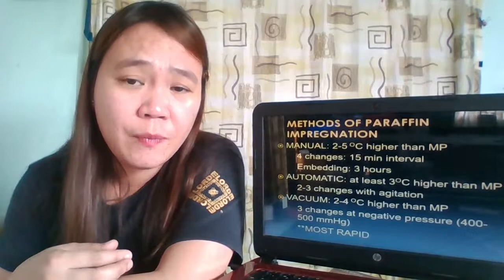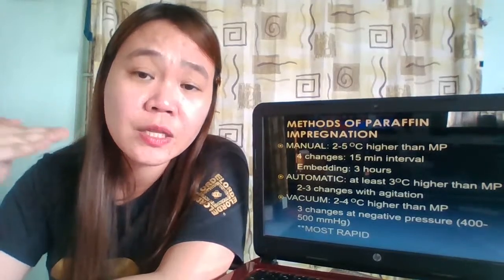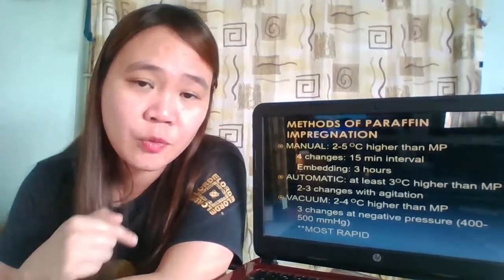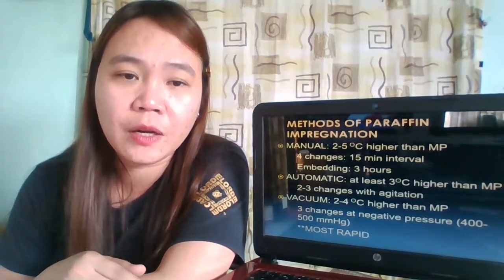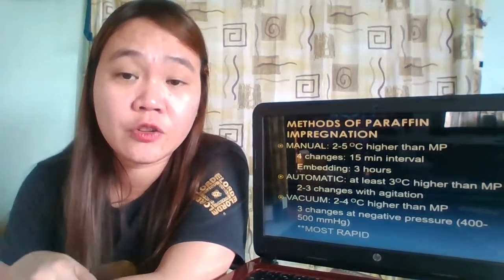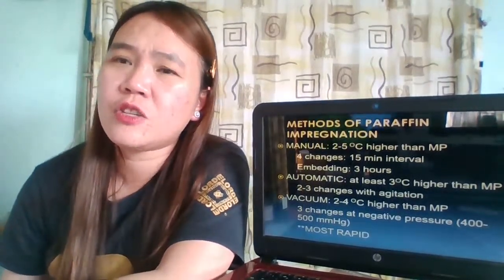So I repeat, there will be no shrinkage and no hardness of your tissue sample because of the reduced time of impregnation. Apart from that, it has also been observed that in using vacuum for paraffin impregnation, no brittleness is observed in your tissue sample.